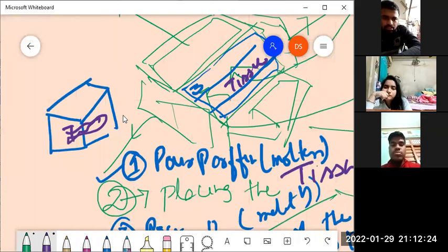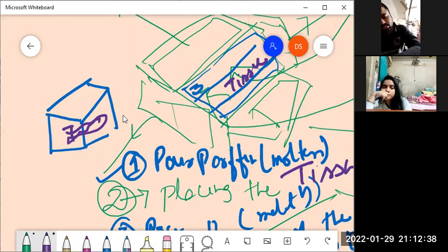Why do we need to trim it out? So as to reduce the thickness of the paraffin material outside the tissue. The more the thickness is removed, the better the sharpness of the sectioning knife is retained. Are you understanding?